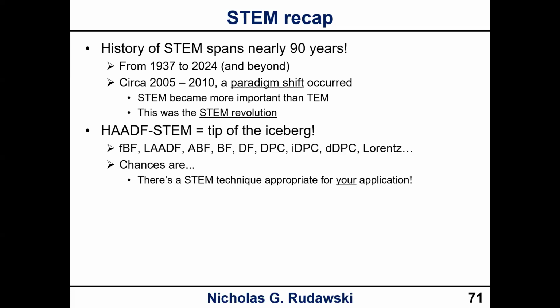I hope you can appreciate from this that HAADF-STEM is really just the tip of the iceberg here. As we saw, there are nine other STEM imaging modes, and the point, of course, is that chances are there's a STEM technique that is appropriate for what you are trying to do, what you're trying to study, what you're trying to work on.